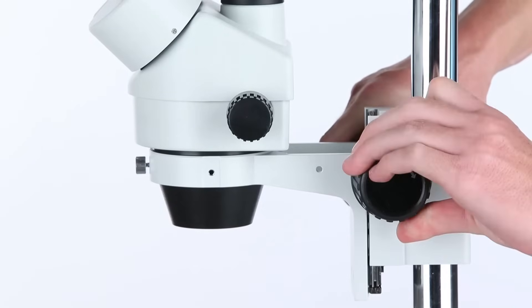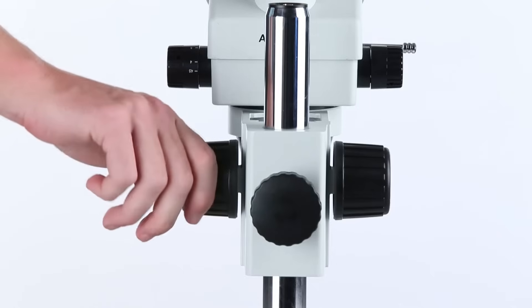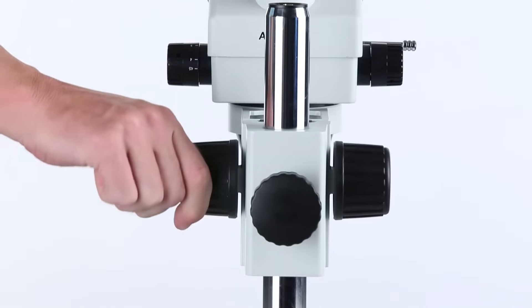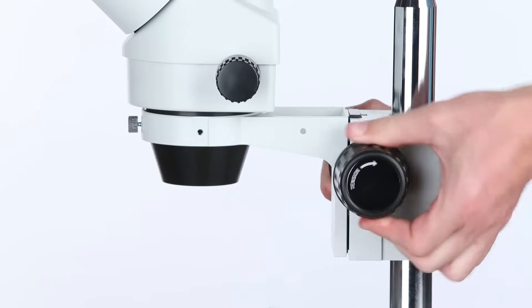turn the tension knob clockwise to increase the tension, counterclockwise to decrease the tension.